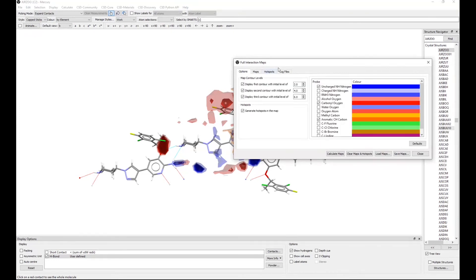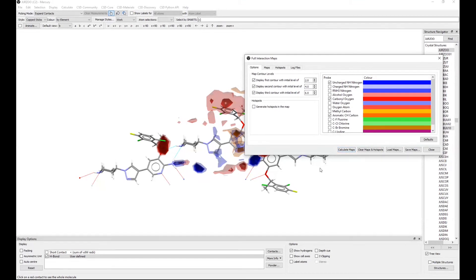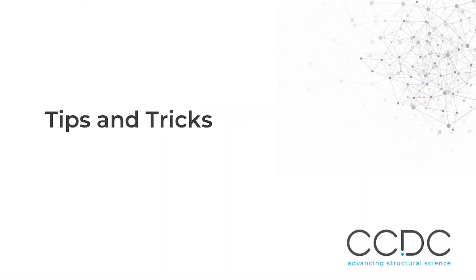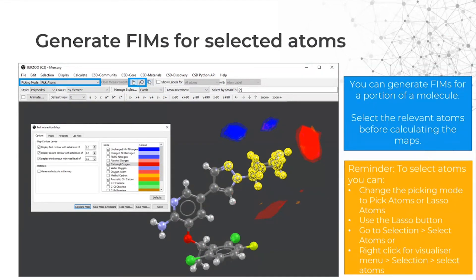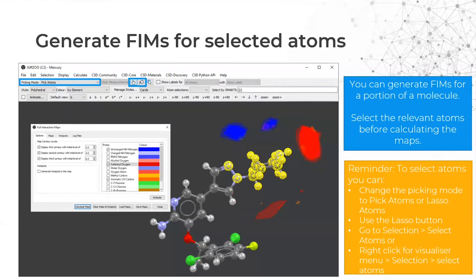It is very easy to generate full interaction maps, and they make really quite striking visuals. The first tip is that you can generate a map for a portion of a molecule — just select the relevant atoms before calculating the map. There are several ways to select atoms in Mercury: changing the picking mode on the top left, using the lasso, the selection menu, or right-clicking in the visualization window. This is useful if you are interested in just a particular part of a molecule or if there are multiple components in the unit cell.